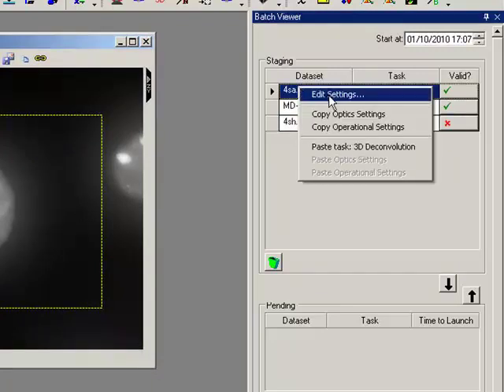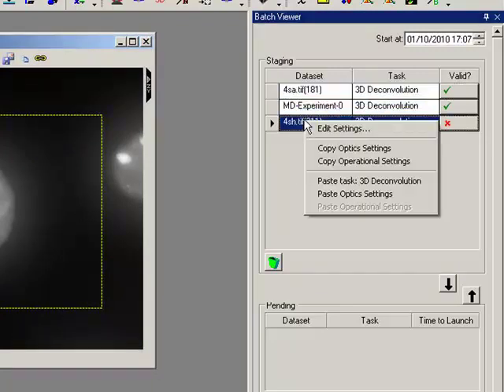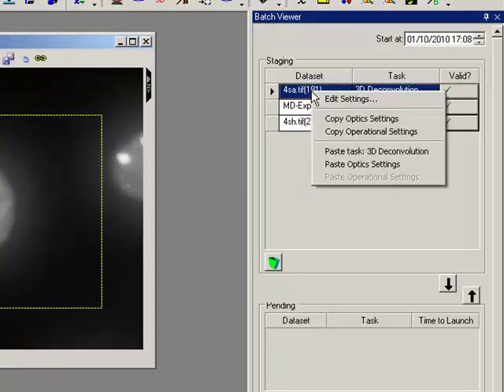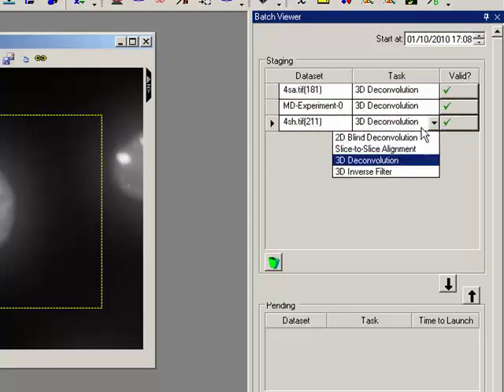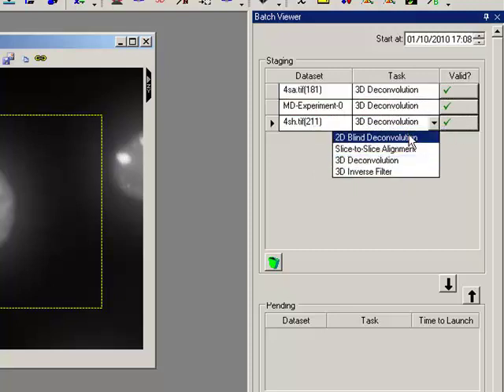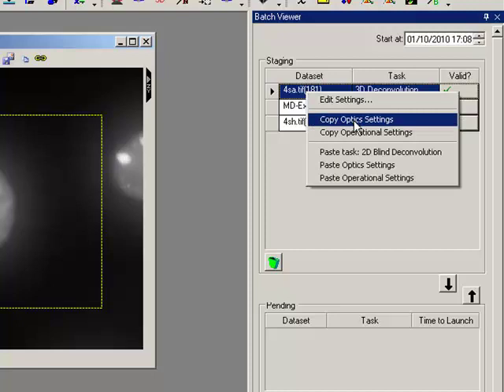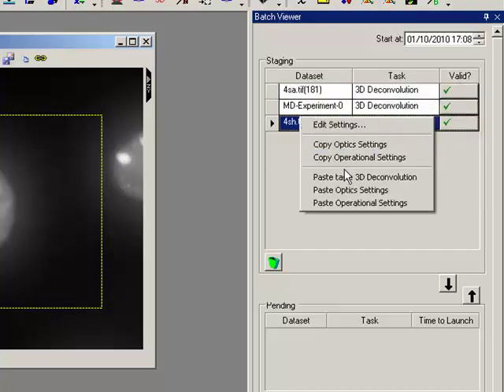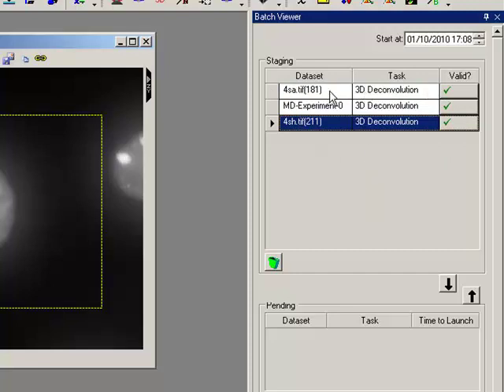So I can simply copy and paste optics settings here. And I can also copy and paste operational settings, so that will effectively, if I was to take this off and change it to perhaps 2D Blind, if I then copy the operational settings and paste them it should change that and make them exactly the same.